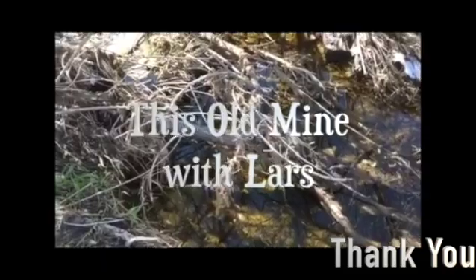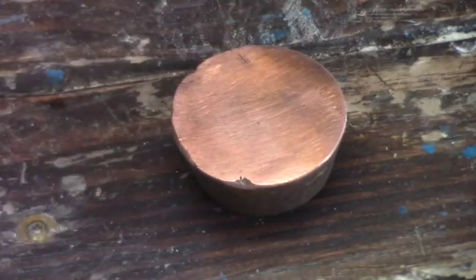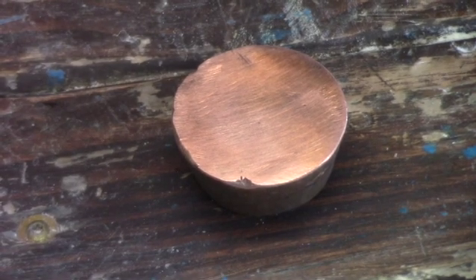Welcome back everybody. I'm going to show you something I found out today — copper can be your friend, especially when you're denoxing. Today we're going to show that we can use copper to indicate whether or not our denoxing process is working.